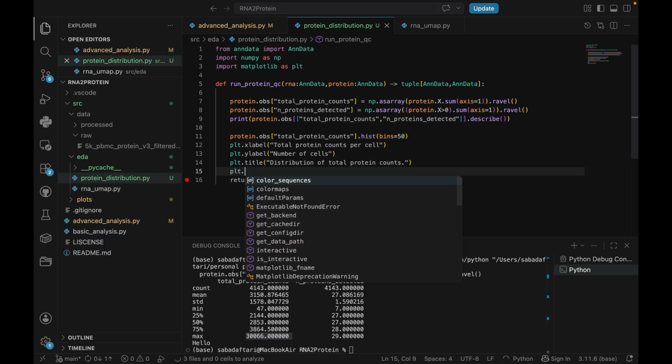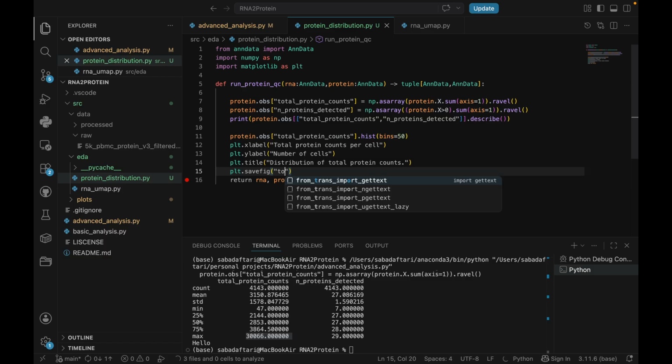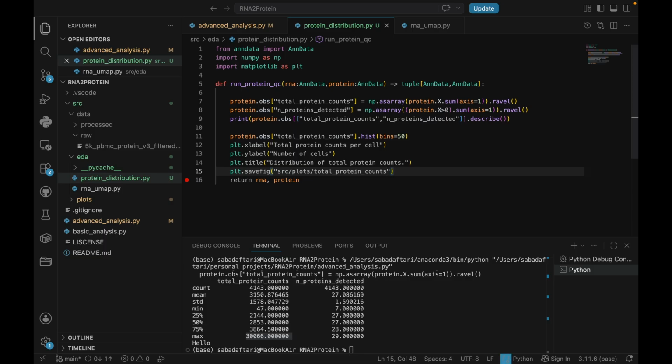And I'm going to save this, give it DPI 300.